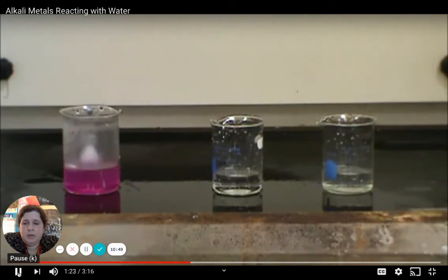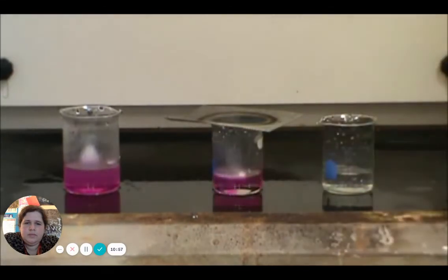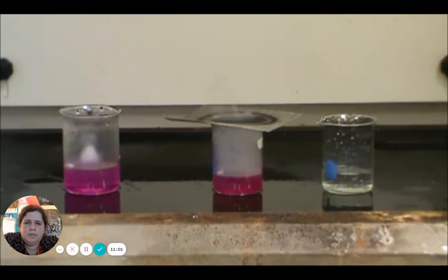Now, I'm not sure what's making it pink. It could be an indicator dye that he's put in there to show that it's a basic substance. And sodium is actually probably going to ignite. You'll see quite a bit, perhaps orange flame, or some sparks, or some shrapnel. So you can see a lot of smoke coming off of that.